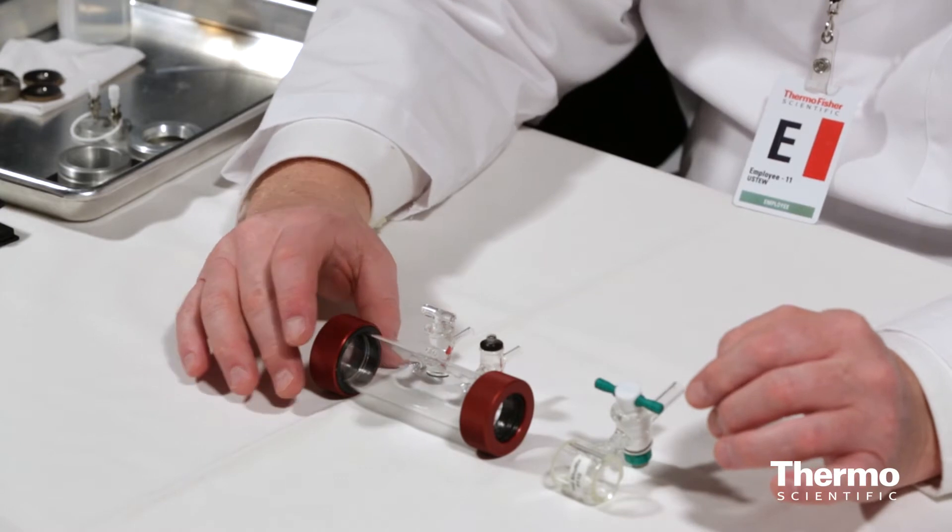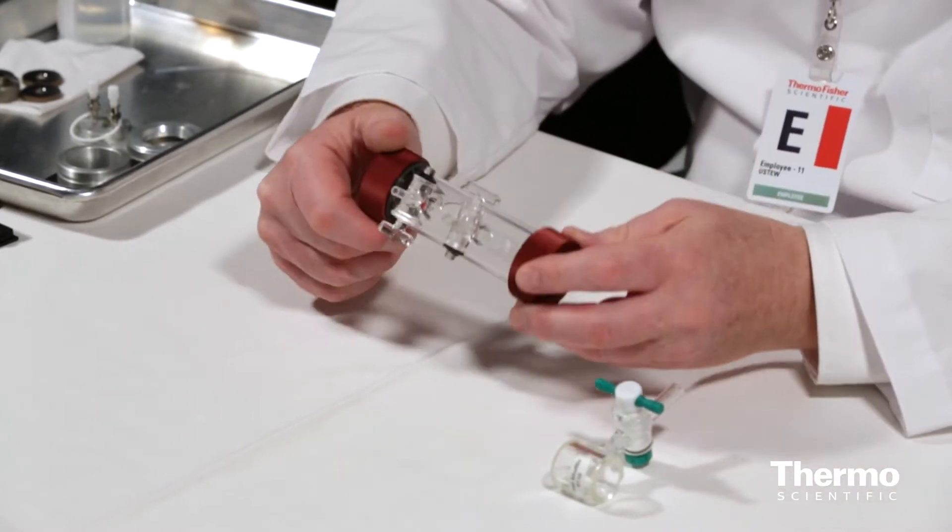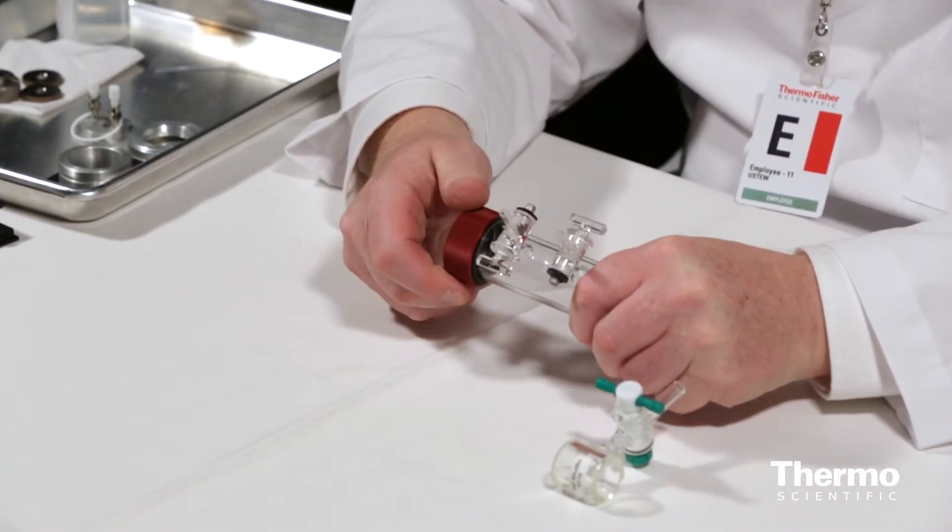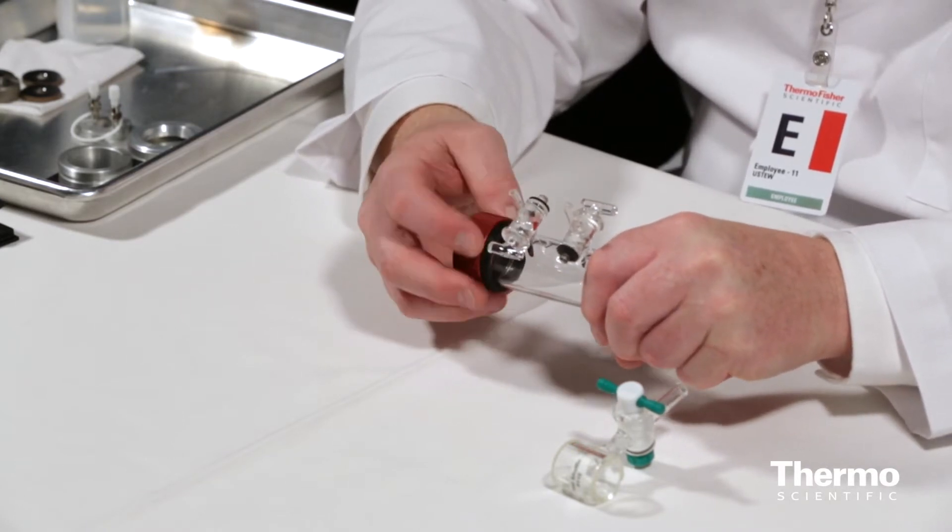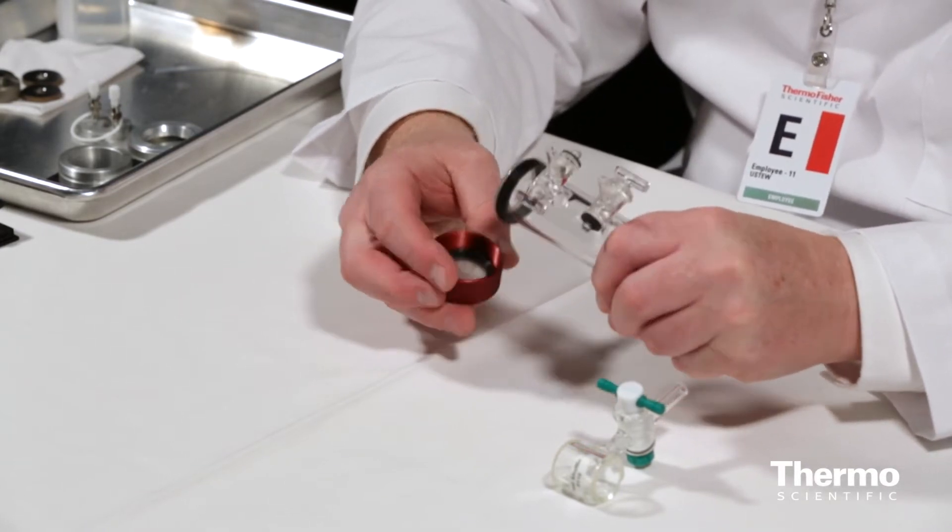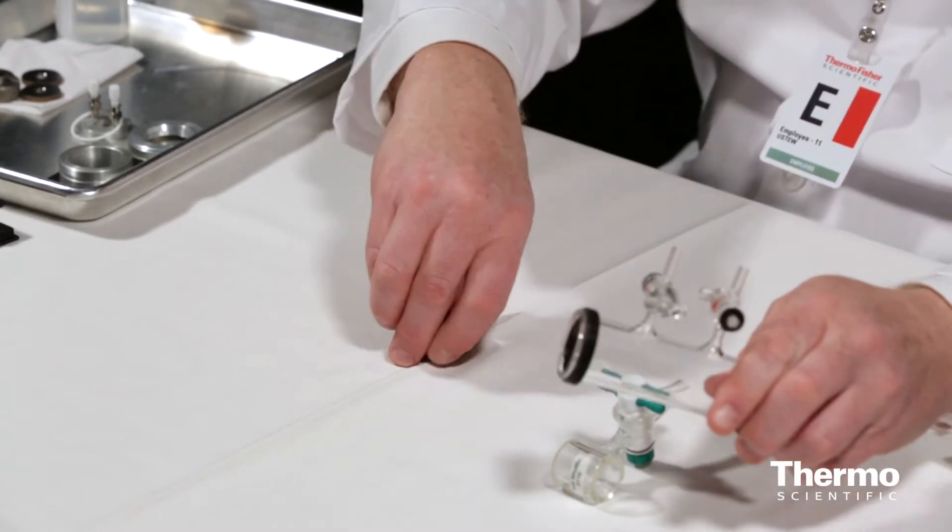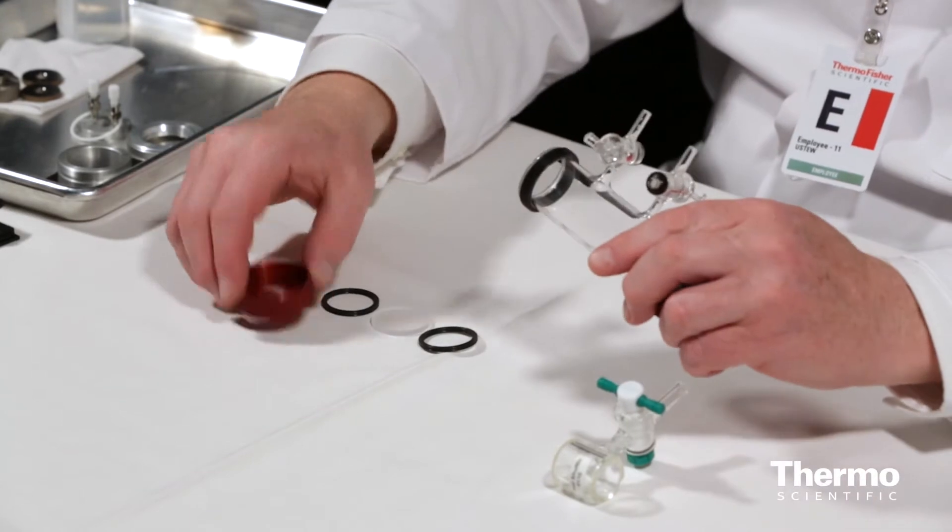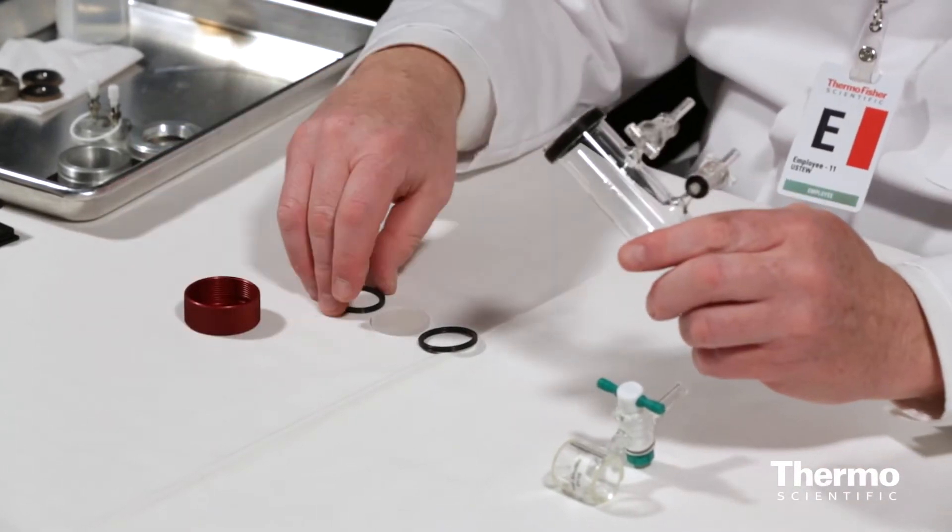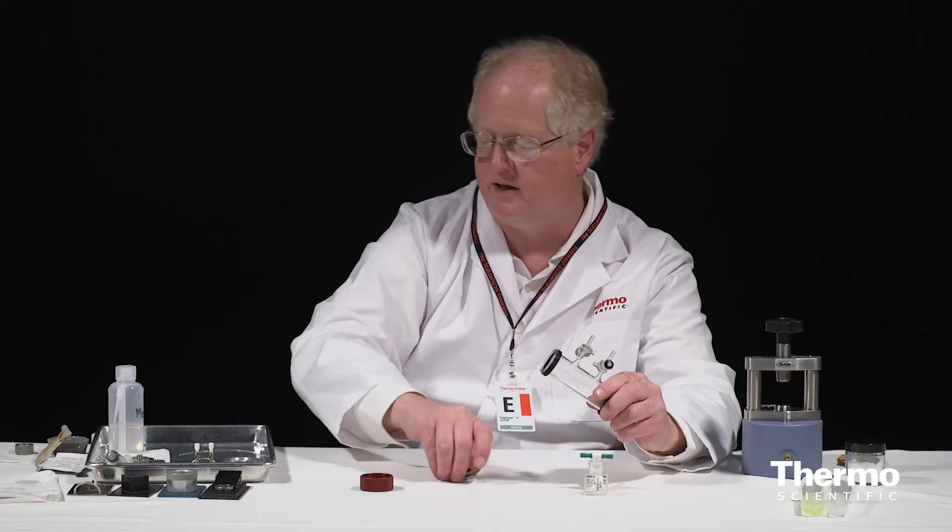This is a standard 10 centimeter cell. It's very simple. I will pop the end off just to show you the end window. There is a gasket on that window. So you have the window and a gasket on each side and the end just screws on and that's all there is to it to make the seal.